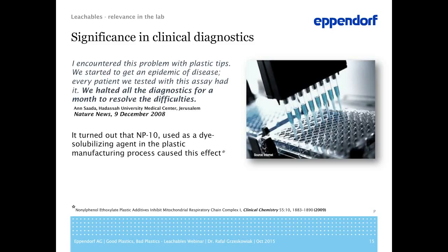Of course, they stopped and investigated their routine assay methods, and after a month of investigations, it turned out that the problems were caused by pipette tips they had recently purchased and used for sample preparation. As later revealed, this effect was caused by a dye-solubilizing agent, NP10, used during the production process of the tips. So as you see, leachables may also have profound significance in clinical diagnostics.